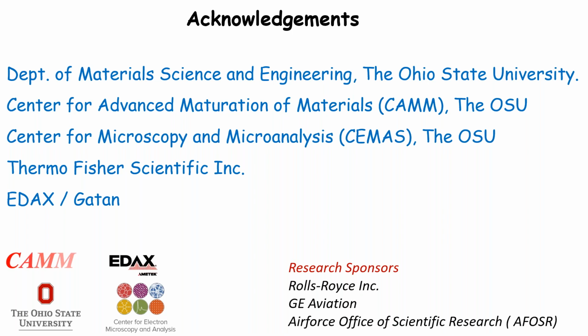Yeah, that's a very good question. Actually, as a user, like all of us know, it's the type of resolution that you want. If you want to go for a very high resolution, you go for low beam current, low beam size. And also, you have to adjust the voltage, because the larger voltage gives you the larger depth, sometimes it will interfere with the precipitates or whatever lying below the surface.